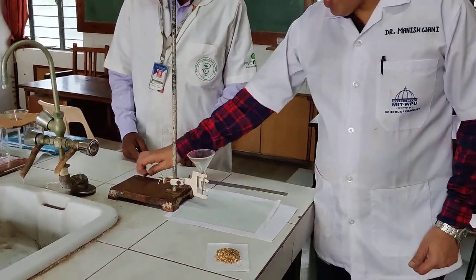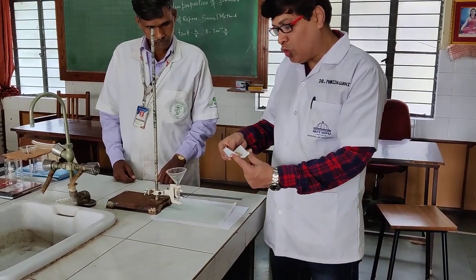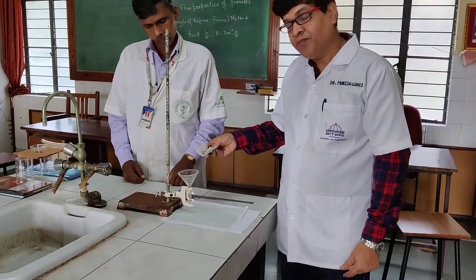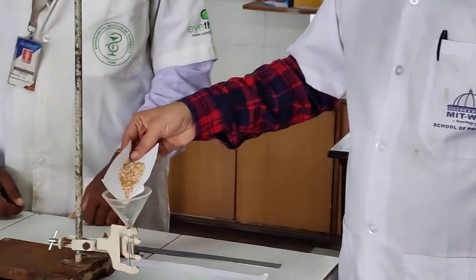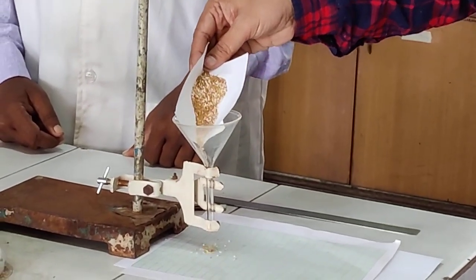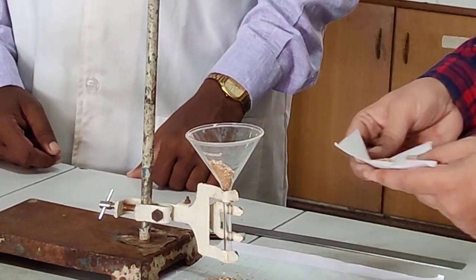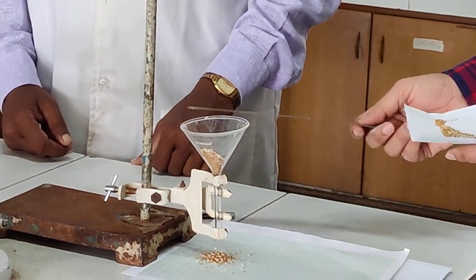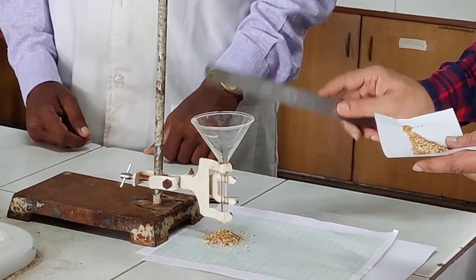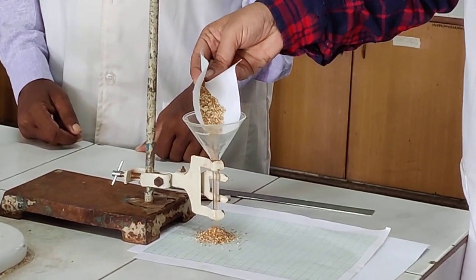Then you are going to have a pencil along with you. You are going to take the granules and slowly pour them inside the funnel so that it forms a heap onto the graph paper. If you don't have graph paper at home, you can use a normal white paper also. You have to pour the granules in such a way that, as you can see over here, the phenomenon which I told you, that is bridging, does not take place. So you have to take care that bridging does not happen as far as possible. If you pour the granules slowly, then there are fewer chances of bridging happening.